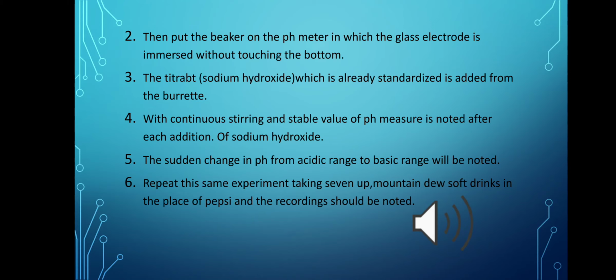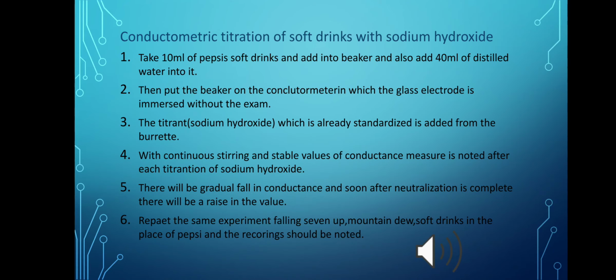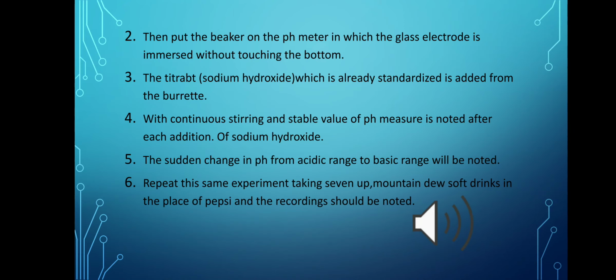Put the beaker on the pH meter, in which the glass electrode is immersed without touching the bottom.